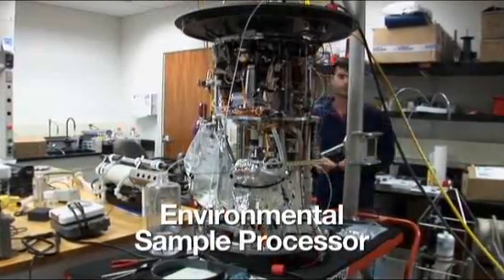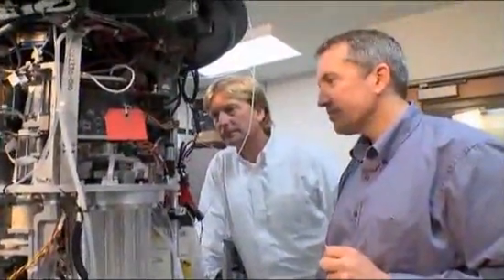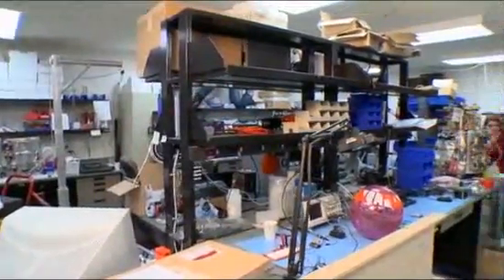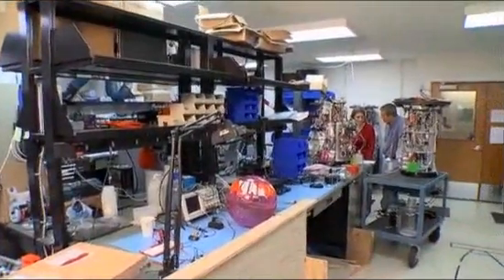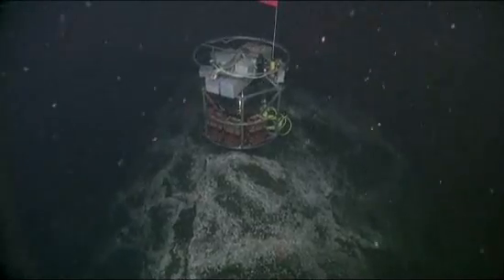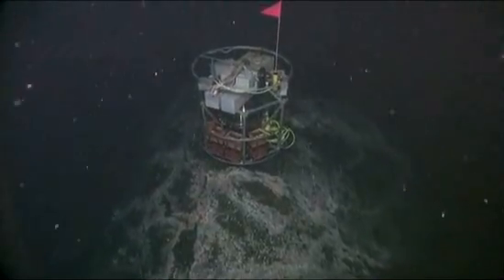The ESP is the Environmental Sample Processor, and it's an instrument that collects water, allows you to extract particles from that, and use molecular probe technology to understand the presence of certain organisms and their activities. With support from the National Science Foundation, microbiologist Chris Scholin and his team at the Monterey Bay Aquarium Research Institute created the portable ESP to work on its own, so they don't have to travel back to the lab every time they want to analyze samples they collect at sea.